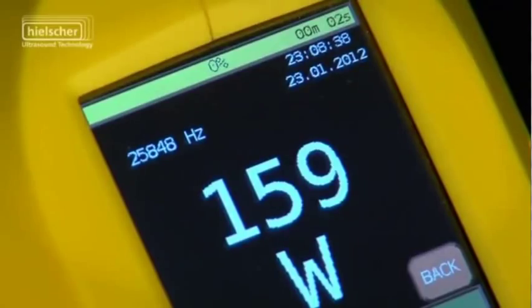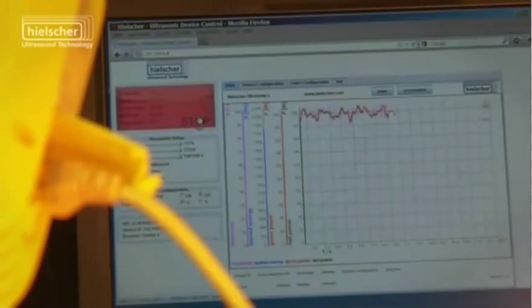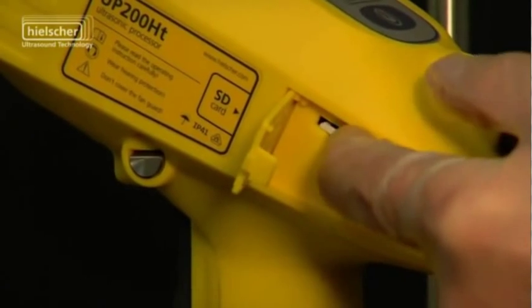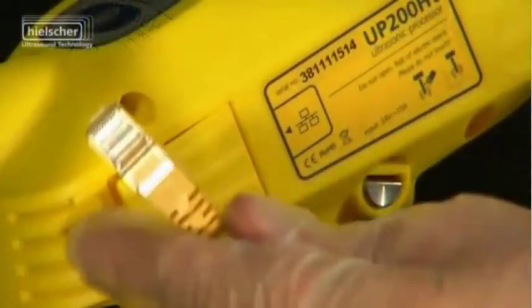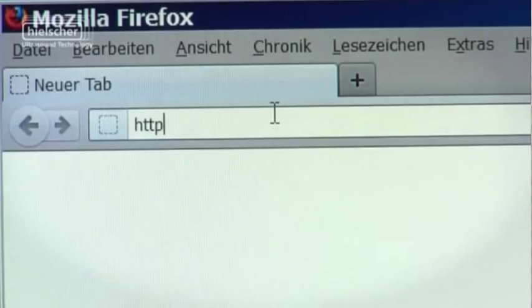By means of its colored touch screen and intuitive control panel, all process parameters can be accurately controlled, displayed, and recorded. The process and measurement data generated are automatically sent and stored on the integrated SD or USB card.